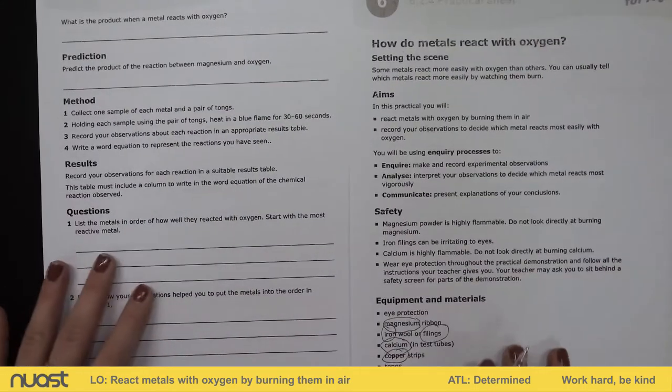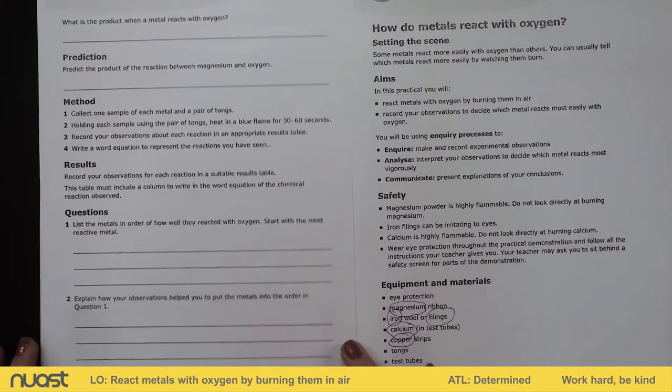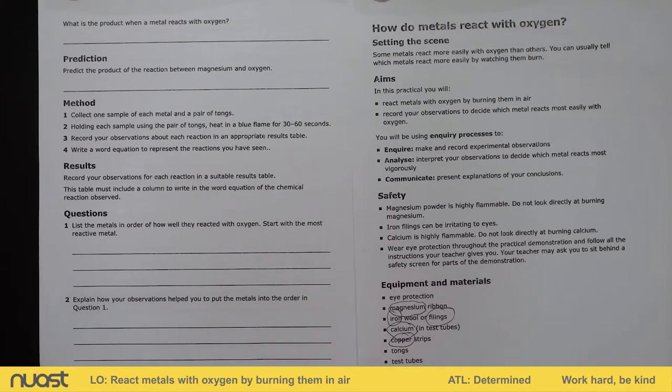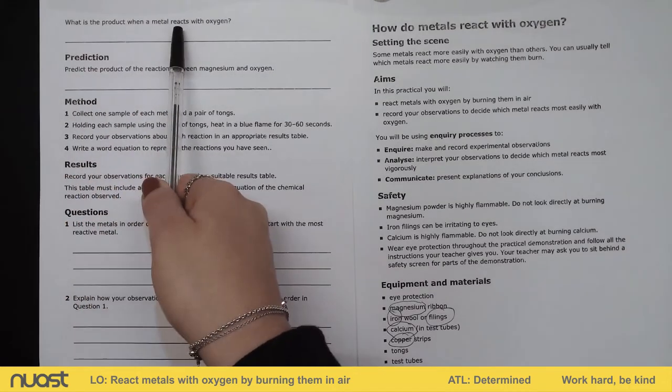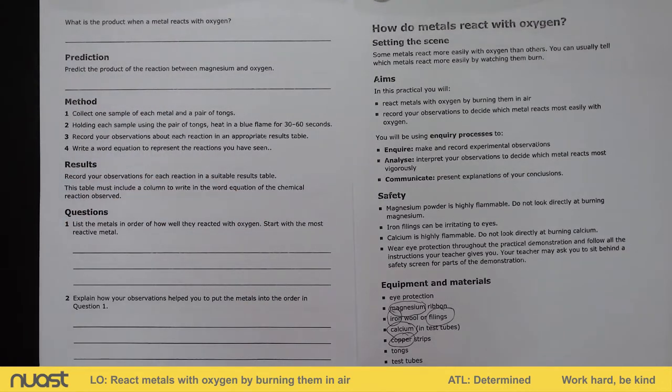So, the first thing I want you to do is have a look at the hypothesis. Our hypothesis asks, what is a product when a metal reacts with oxygen? So please pause the video and fill in the hypothesis. What products do we form when a metal reacts with oxygen?